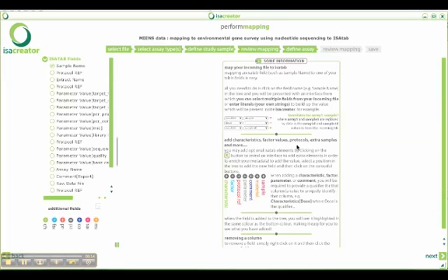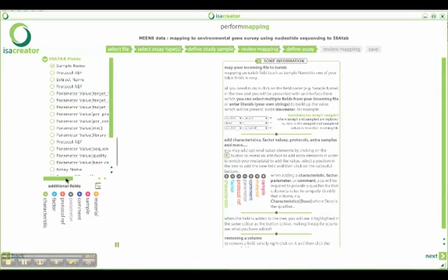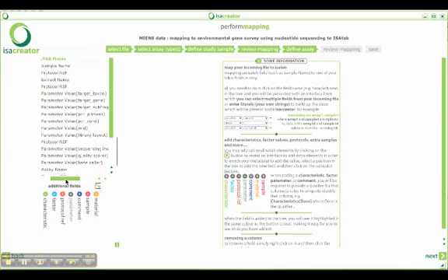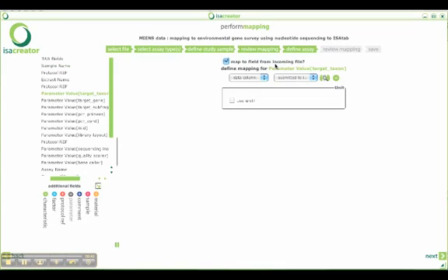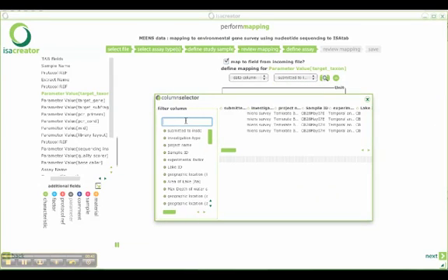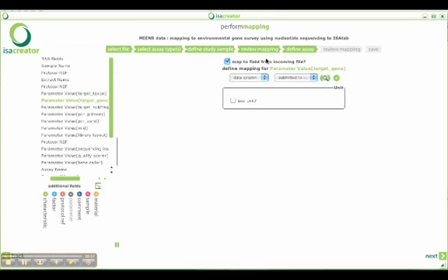the field corresponding to the assay section. So this is the ISA-Tab. These are the ISA-Tab fields required or necessary to describe an environmental gene survey assay using high-throughput sequencing. So we need to make sure that we capture all this information. These are MIxS requirements for such an assay. And the thing is, by default, of course, this first field is hooked up to this element here, and we now can look for information if there is anything like this about the taxon information. So just by typing target, we see that there is a field for target gene, but not necessarily for the target taxon. So let's go for the target gene instead.